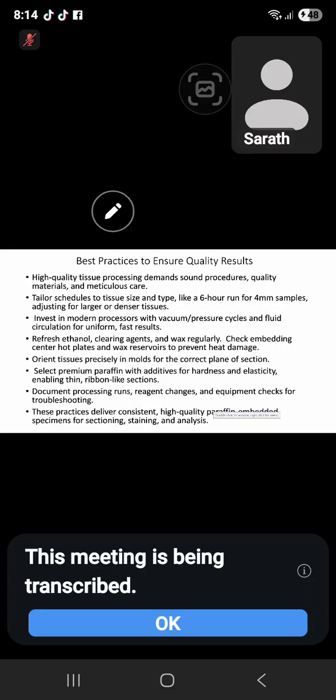Then, high quality tissue processing demands sound procedures, quality materials, and meticulous care. So when you are expecting high quality tissue processing, you must have exactly correct procedures. You have to follow the correct procedures, use quality materials, and take meticulous care. You have to do it with very much care.